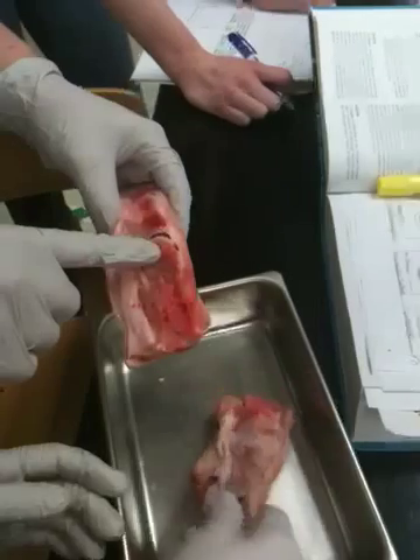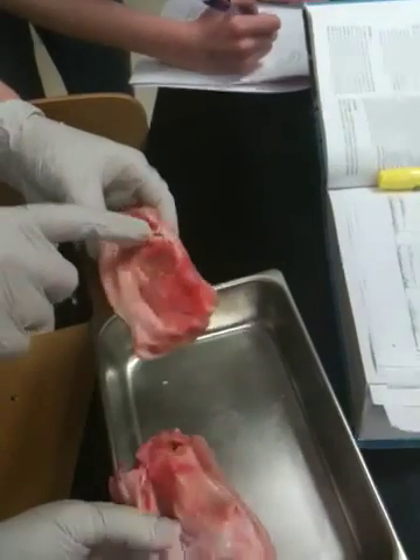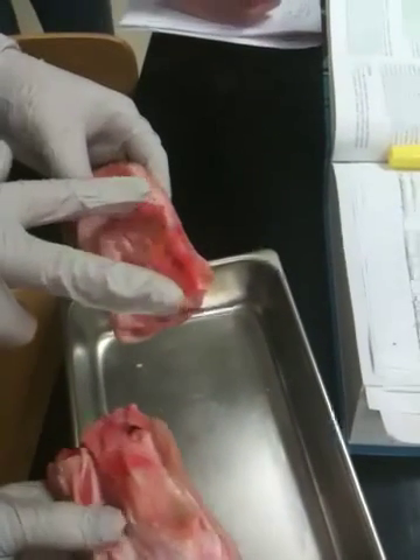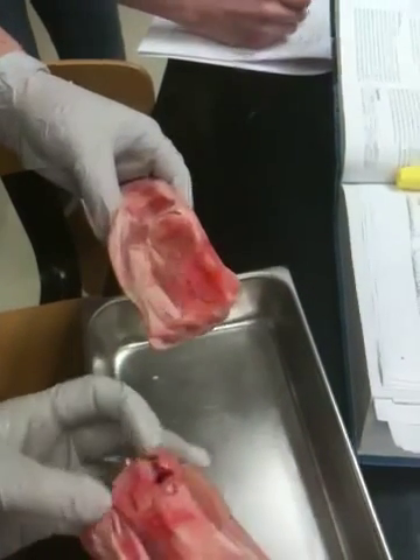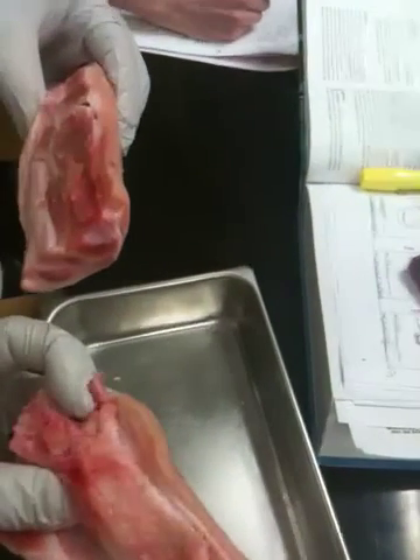So the epiphyseal plate is when it's growing; the epiphyseal line is the remnant. And then the epiphysis — that's the ends of the bones. Spongy bone is found in the epiphyses. Look, it's bleeding. Spongy bone is found in the epiphyses.